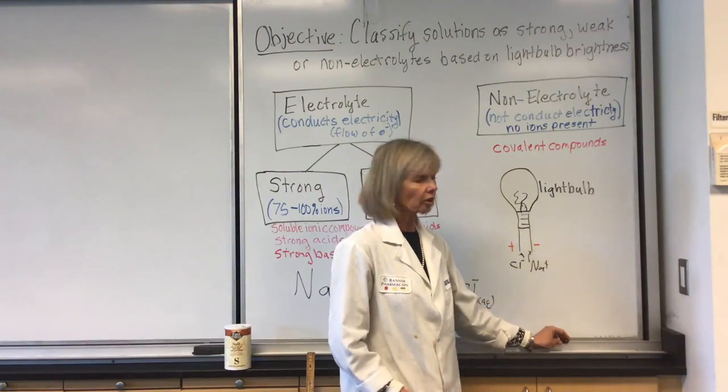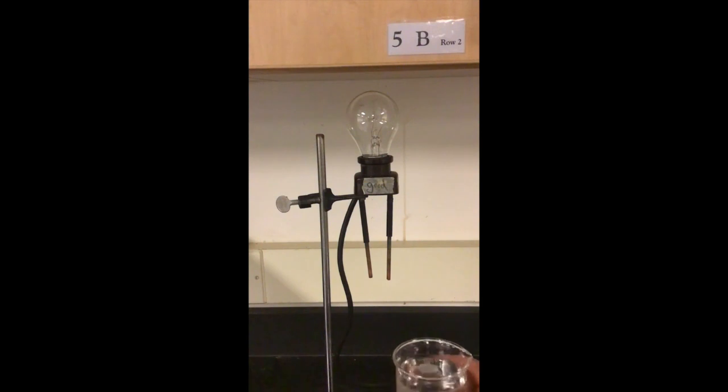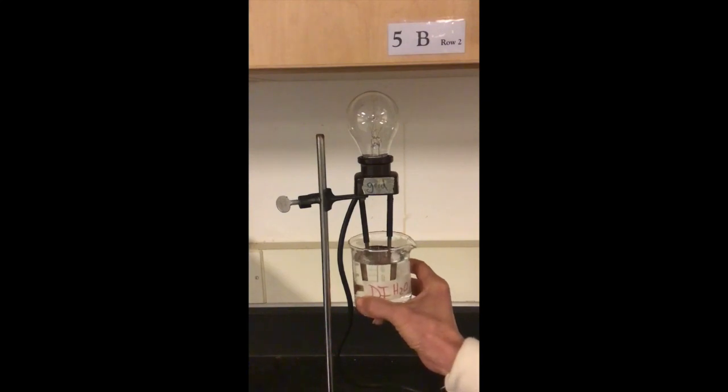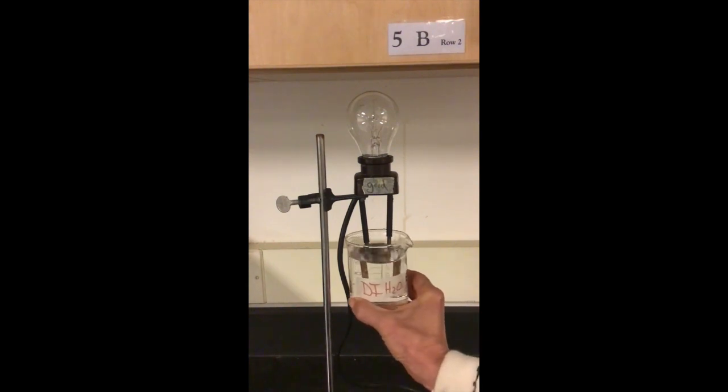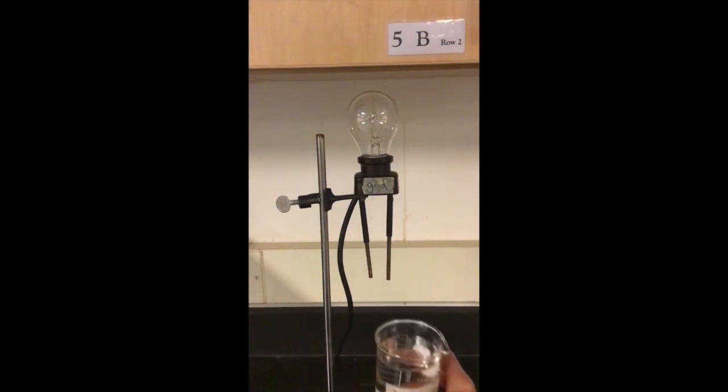Let's go ahead and take a look at our solutions. The first compound we're going to test today is deionized water. We're going to bring the beaker containing the DI water up so the probes are inside our solution, swirl a little bit, and check our light bulb to see if we're conducting any electricity. As the name implies, deionized means the ions were taken out of the water, so we would not expect that to light up the light bulb.